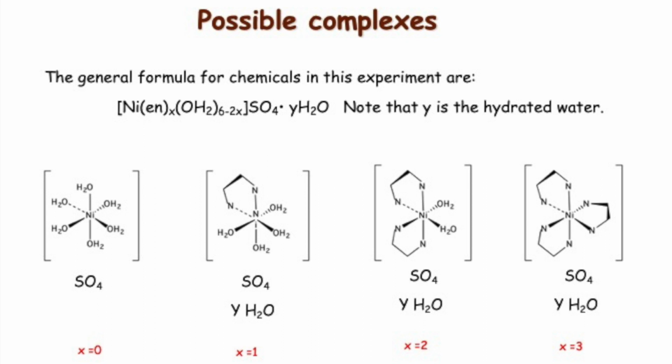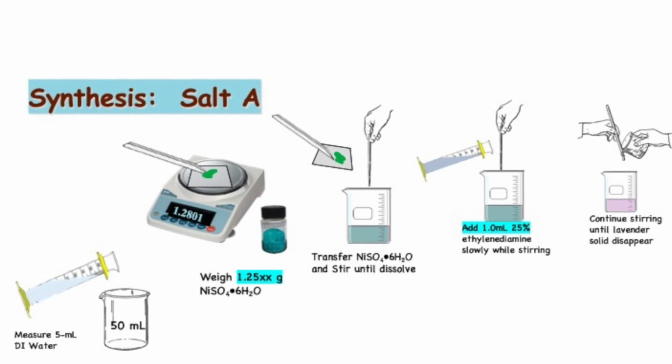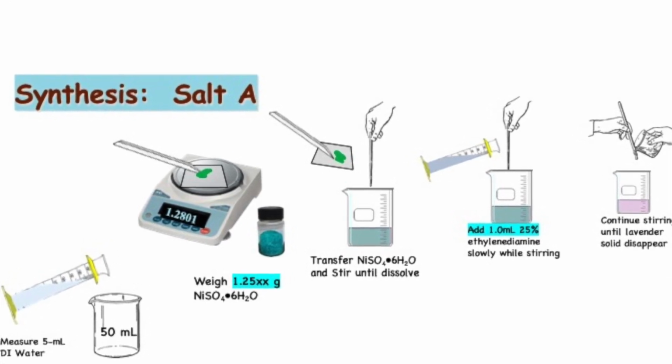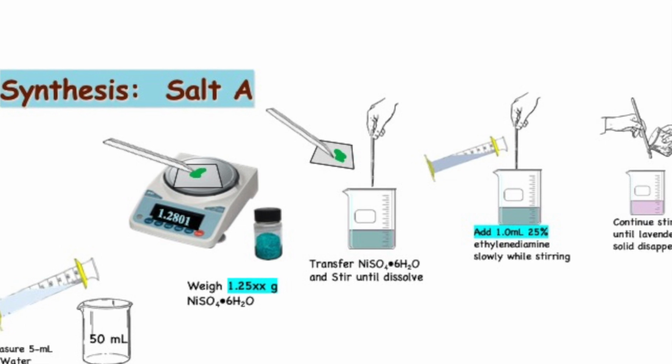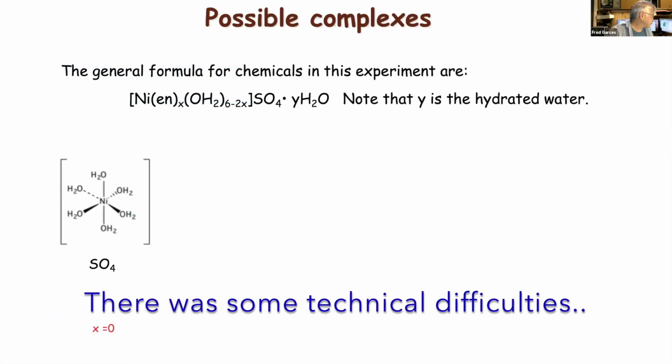Okay, that's one thing I want you guys to remember. So the synthesis of salt A, and pay attention to this, you take a certain mass of nickel sulfate. Here is what I was talking about.